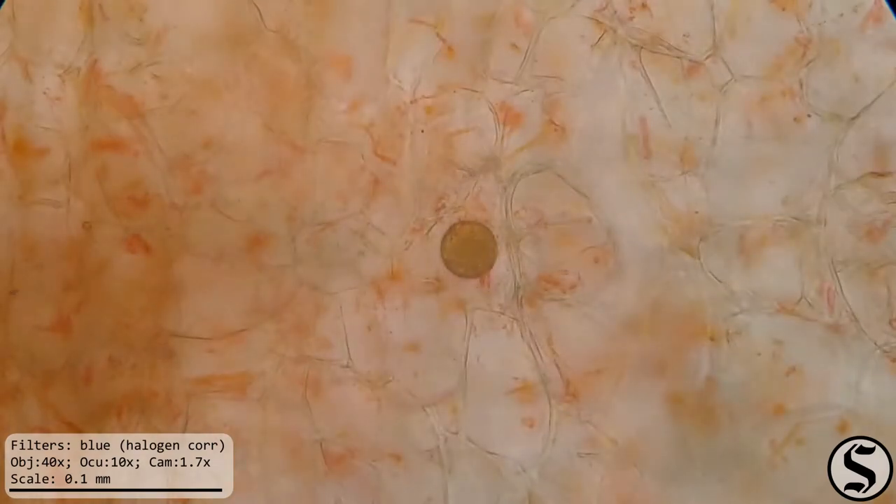And what is that little thing? Let's zoom in on that. I don't actually have any idea what this is. It appears to be pretty spherical — it could be a bubble in there of some kind, or maybe something that the plant grew around. I don't really know. That's interesting.